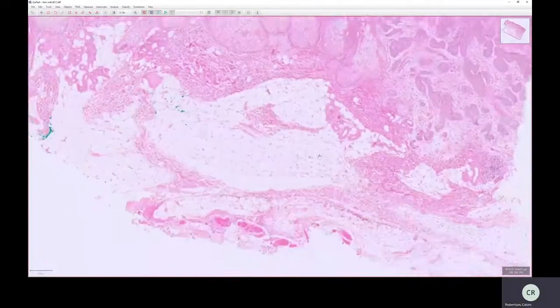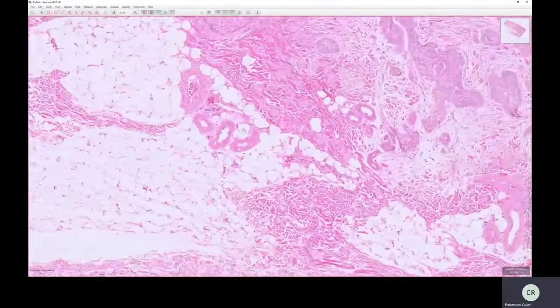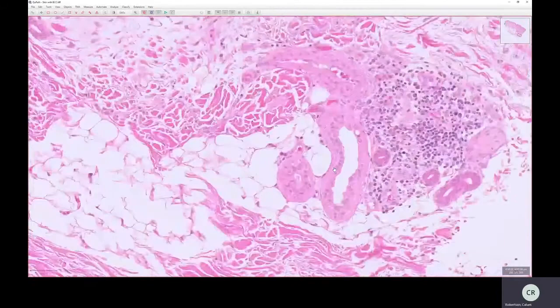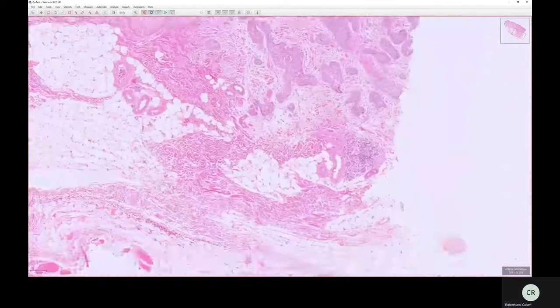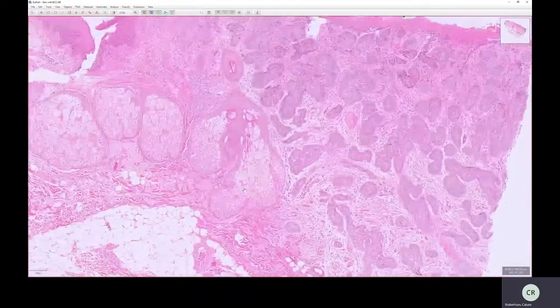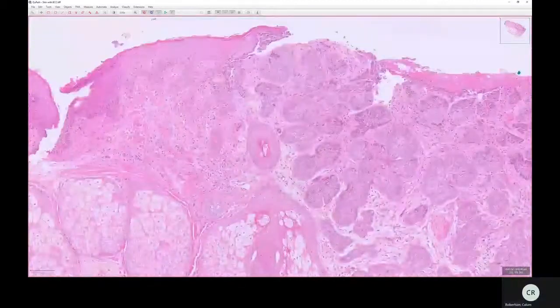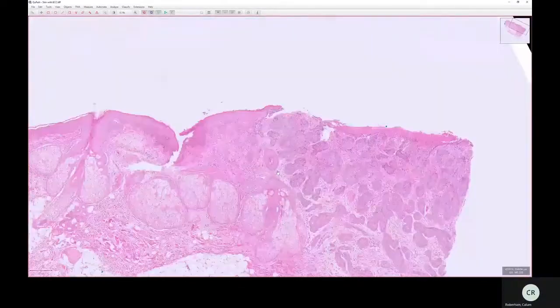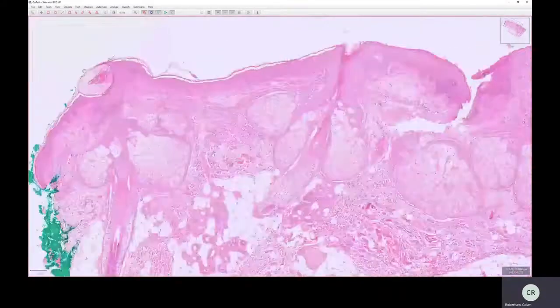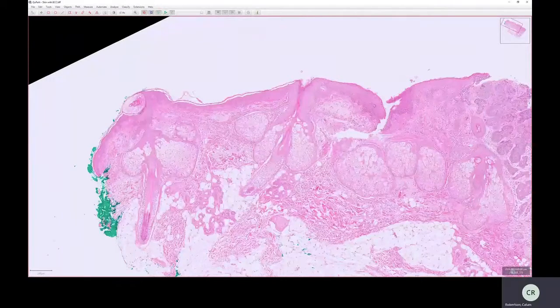The other place you can find smooth muscle is around blood vessels, specifically around blood vessels of the arterial tree, because veins are thinner walled and you won't see the muscle around them in the same way. I think we'll cover this later on when we go to a section of a GI section.